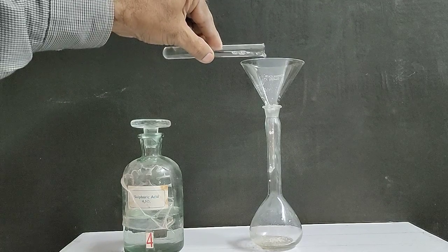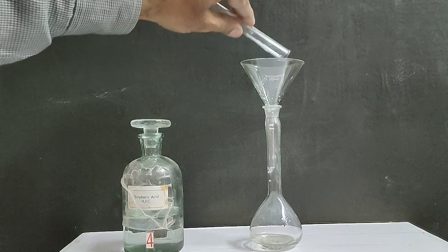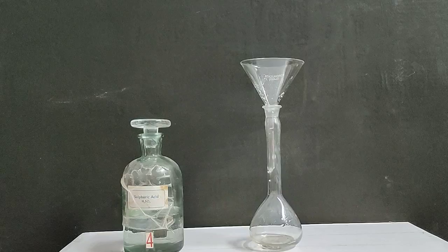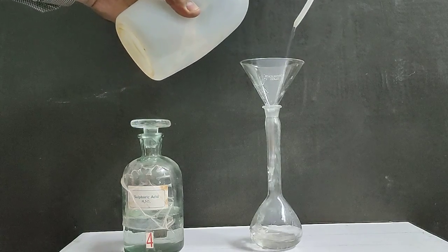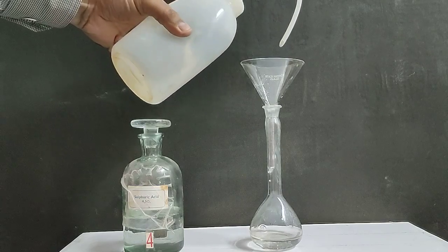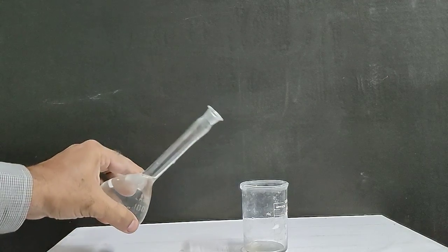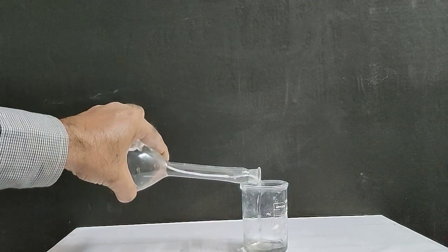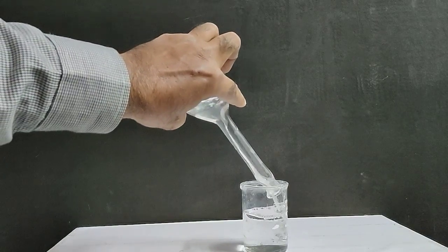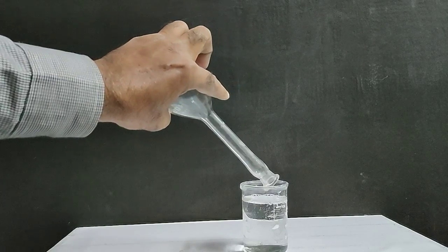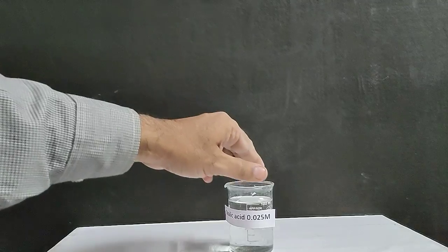Add half test tube dilute sulfuric acid as titration takes place in acidic medium. Add water. Oxalic acid solution with 0.025 M is prepared.